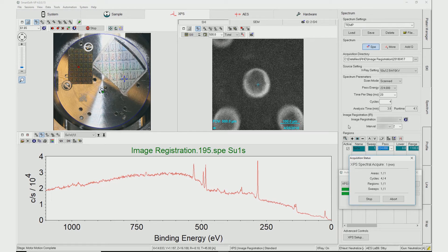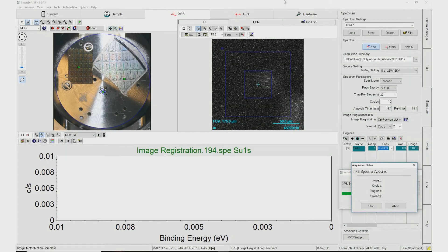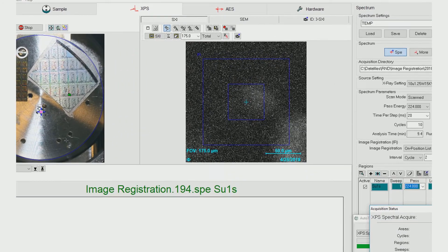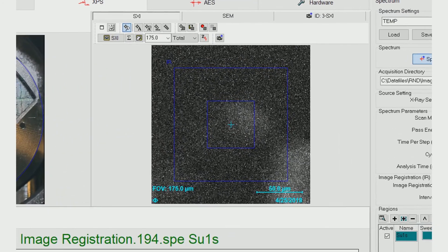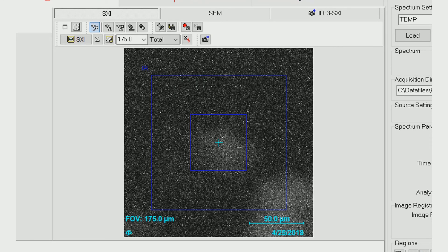The final analysis point, at around 25 microns, is a small enough feature to justify Image Registration. The new SXI of the area is taken and does not exactly match the Image Registration reference image, as the stage has positioned it slightly differently from where it was when the original SXI image was taken. The X-ray beam is adjusted to compensate for this, and the acquisition proceeds as specified.